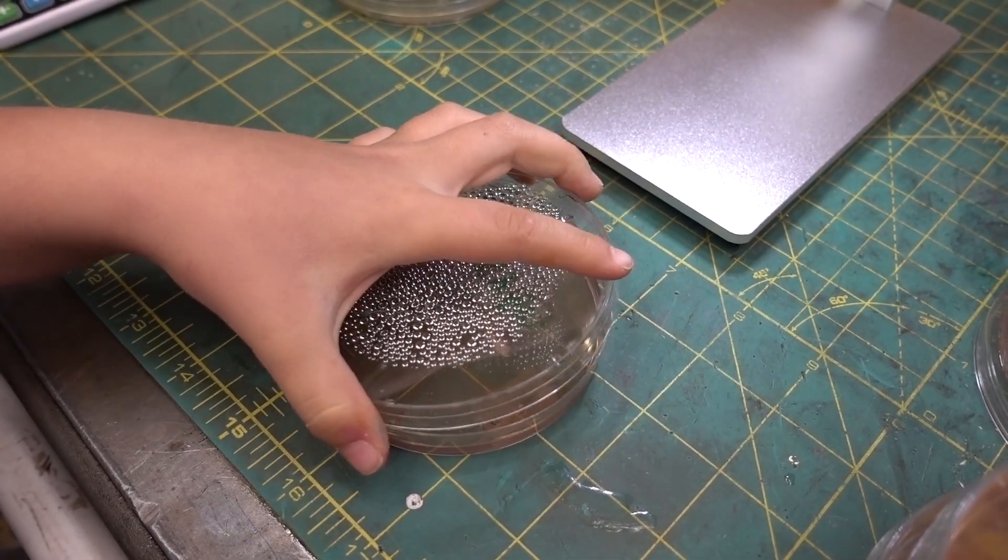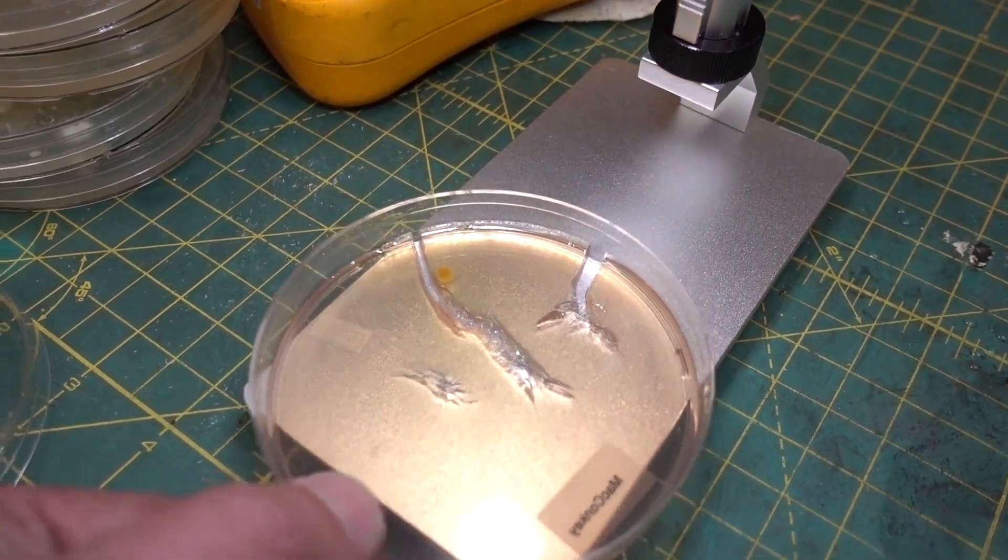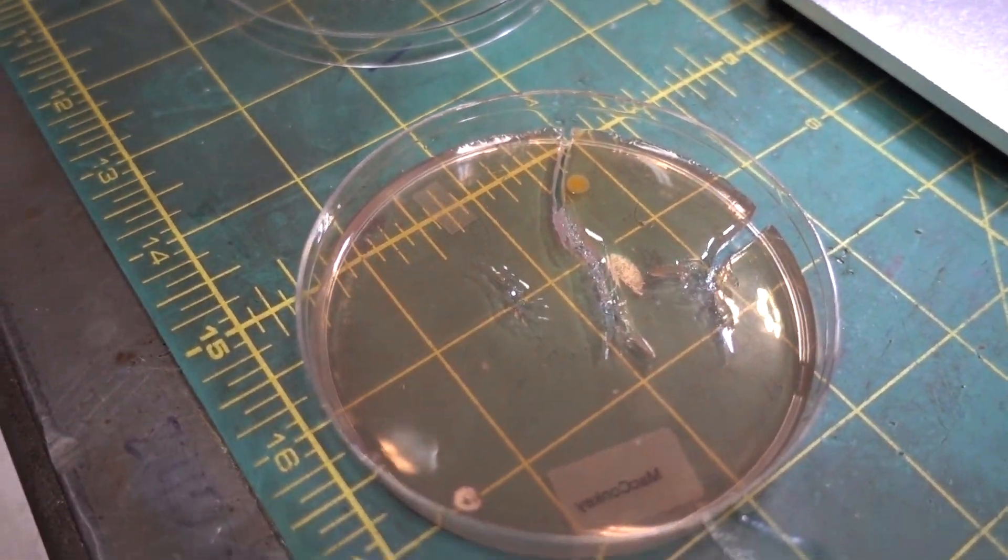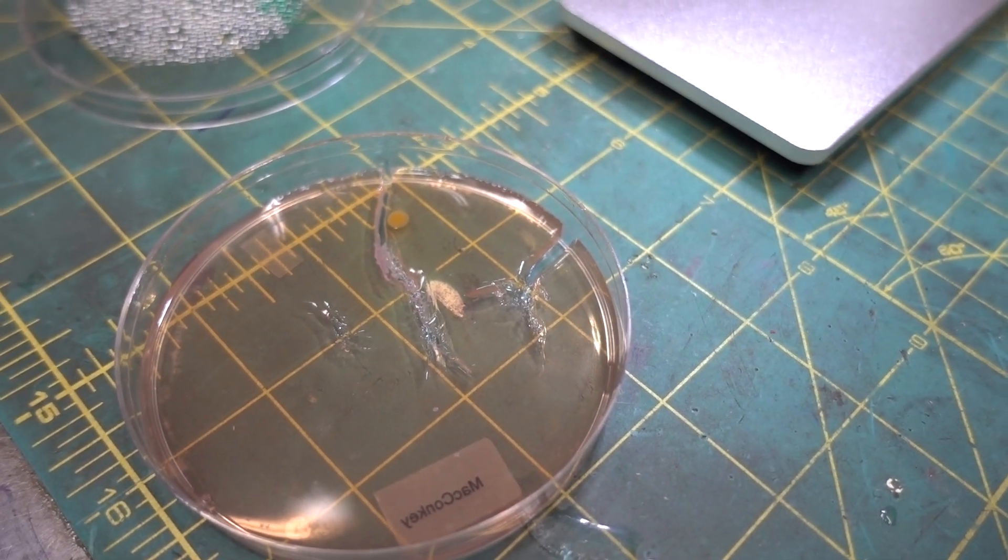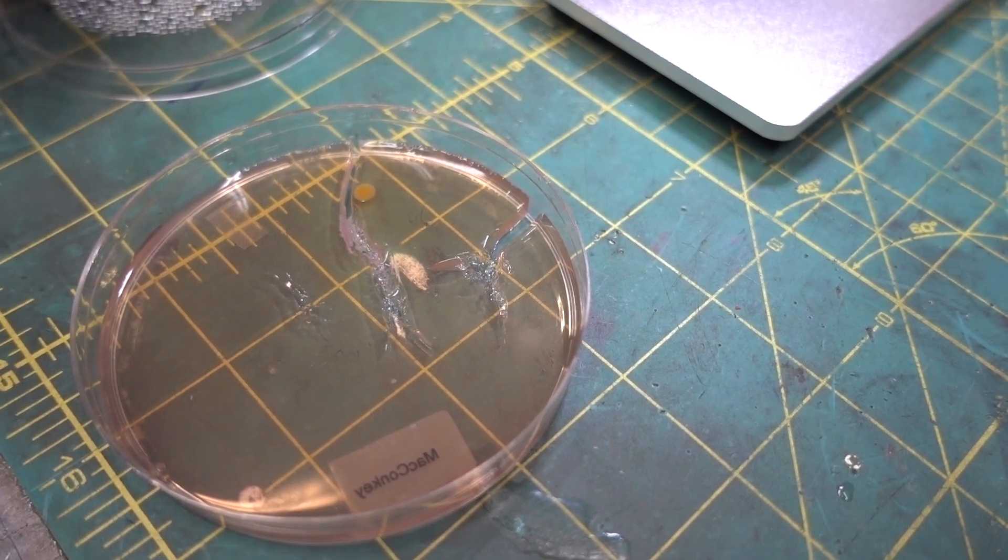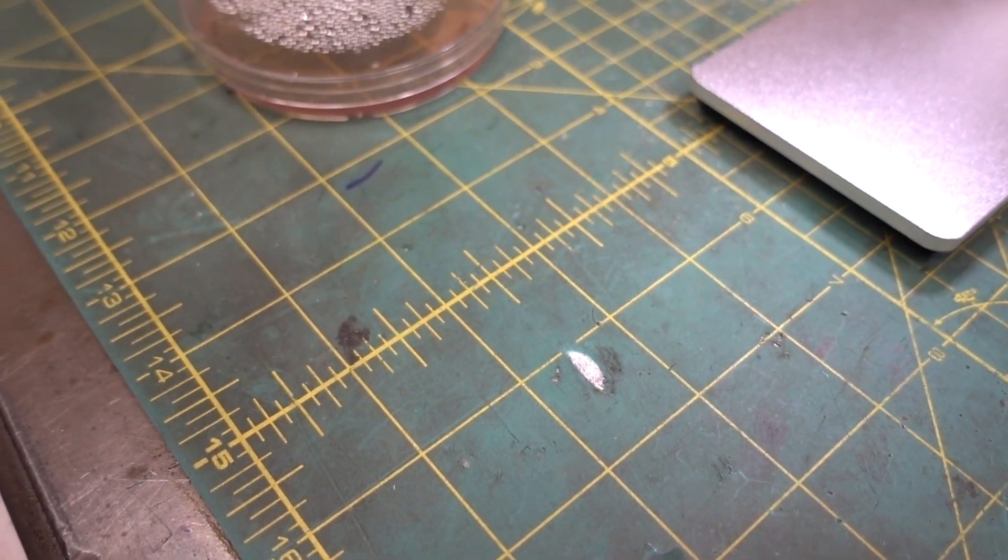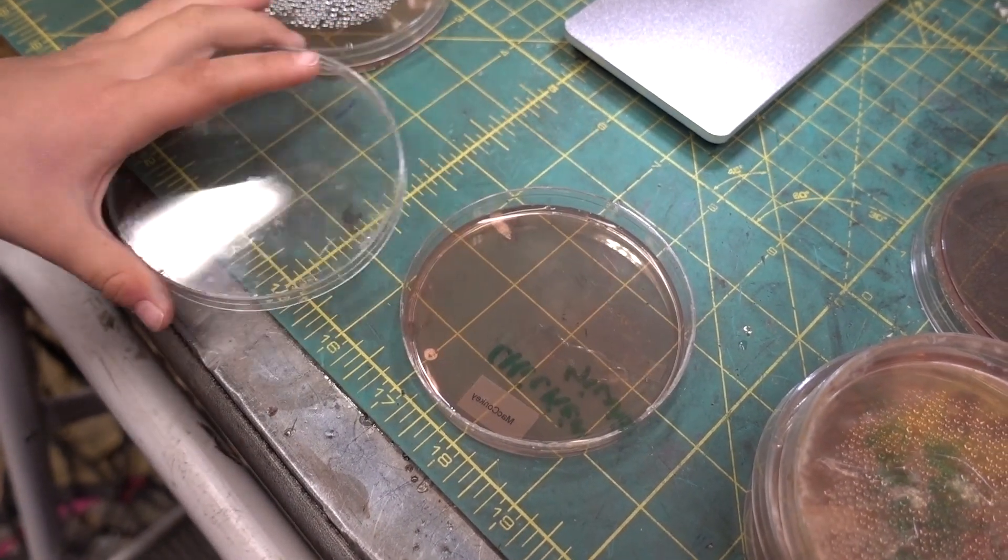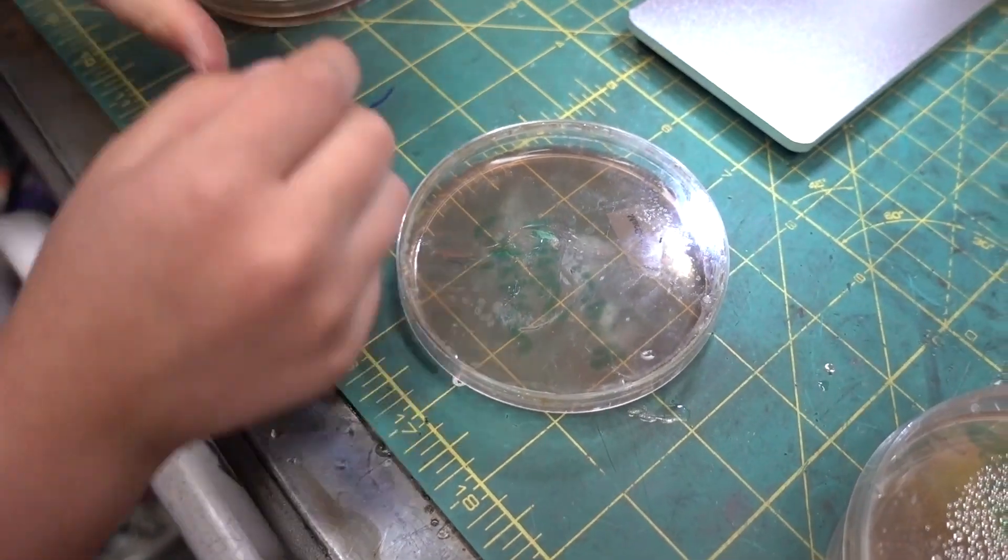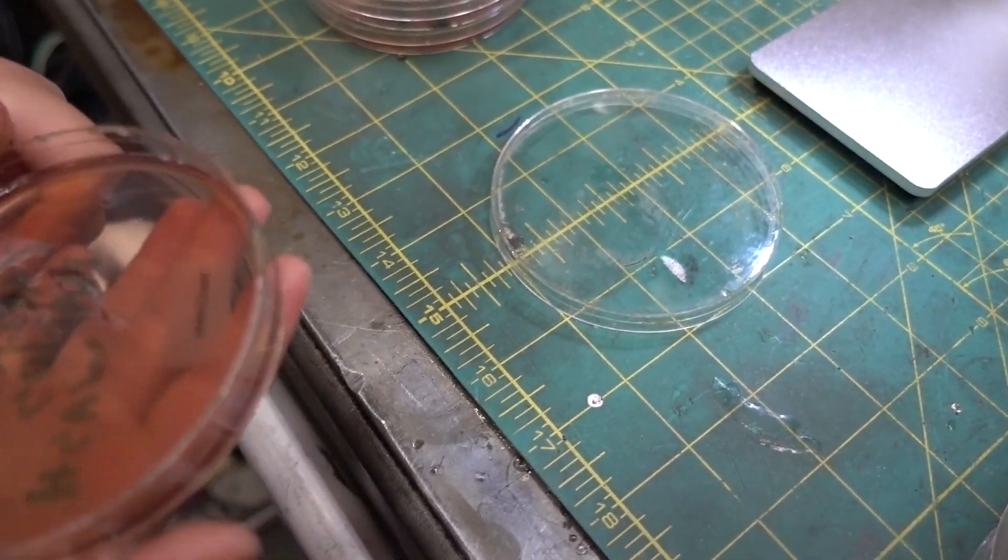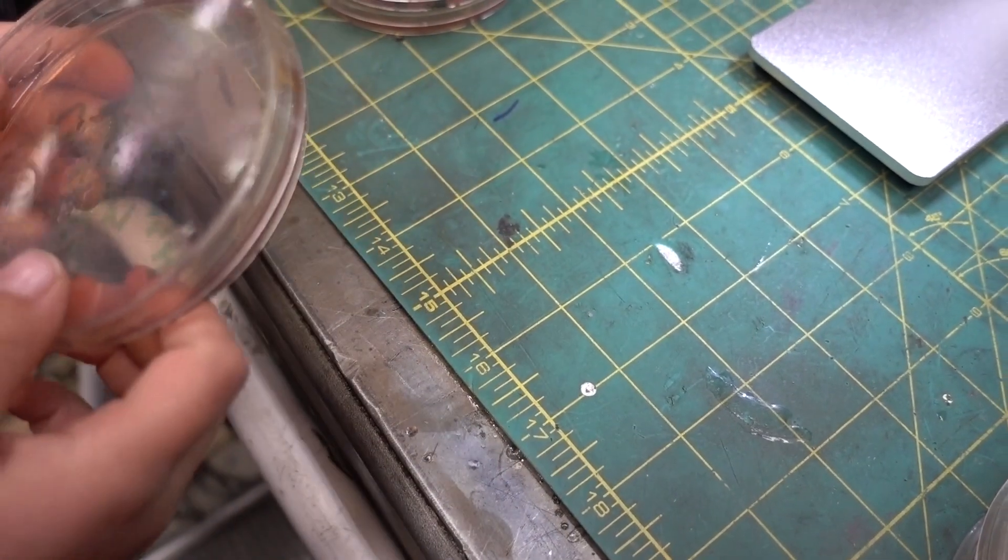This is MacConkey, it's even more fastidious. That was your dirty hand. What do you see on there? I see nothing. Nothing. Oh, there's one little colony on there. Only one thing I see, which is honey. It looks like honey. It's a weird color, isn't it? Why did I only put one thing on it? It's probably something not that great. Probably that lives inside you that causes pneumonia, I bet. Boys and girls, this is after I rubbed my hands on the silver coin. There's nothing on it from the silver coin. It disappeared. And here is after you've washed your hands. What do you see in there? Nothing too. So what's that mean? I'm good and clean. Soap and water killed bacteria too.